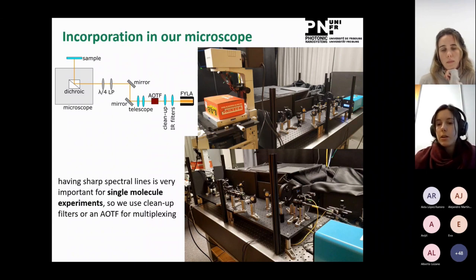And in case it's not in this picture, we also have an AOTF, an acousto-optic tunable filter, that we can also use to select individual laser lines, up to 4 channels at the time, and one can also use this to interleave them. So one can do multicolor imaging or interleaved imaging, changing the wavelength.